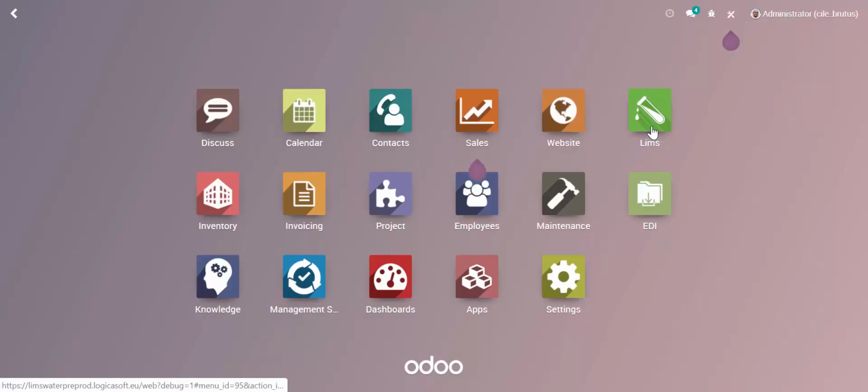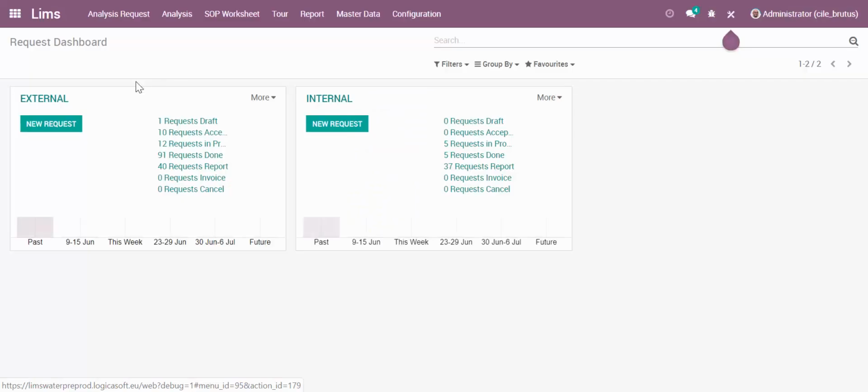So if we look at the LIMS, you will see in part 2 of the video that it is focused on LIMS for utilities. So when you are a utility, you usually have sampling points, but a lot of laboratories, even if they perform a lot of work for utilities, also have external customers, or they just perform some analysis by receiving samples not related to a sampling point.